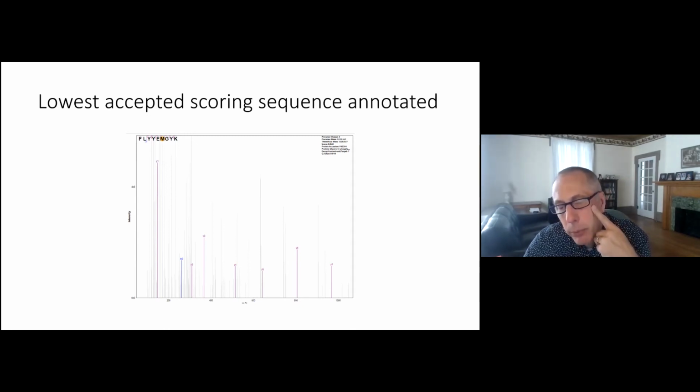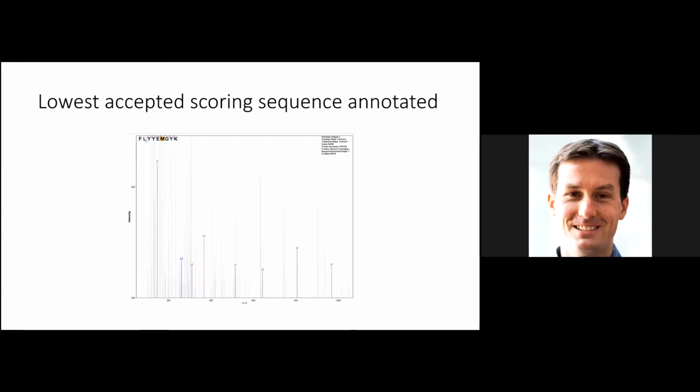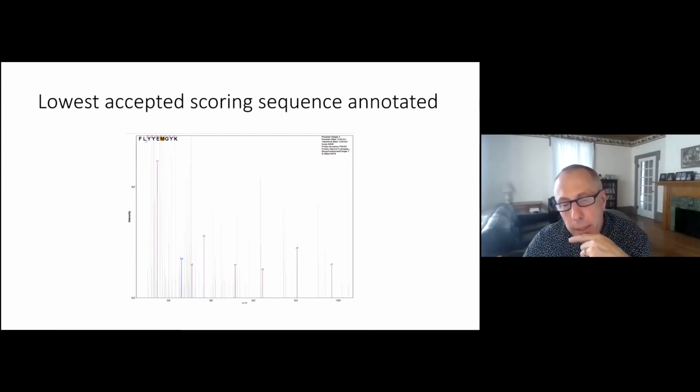So we are always reporting the best match for a given theoretical mass and MS2 spectrum, but you can still have multiple matches for an isolation event because there can be multiple peptides isolated and fragmented. Right. So it's the best match per spectrum mass pair. Yes, that's correct. And it's only one. So it's either Target or Decoy, like not both. It's like winner take all in our software.